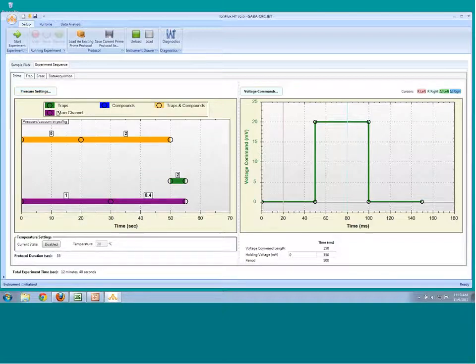And here we have the traps, the main flow channel, the compound wells, for both the traps and the compound wells. So this would be a special item that's unique to the priming phase, which is simply designed to apply positive pressure to both the traps and the compounds. So much as one would do on a manual setup, one would be applying positive pressure as the pipette is being brought into solution. Just so on the IonFlux, we would be applying positive pressure to the traps.